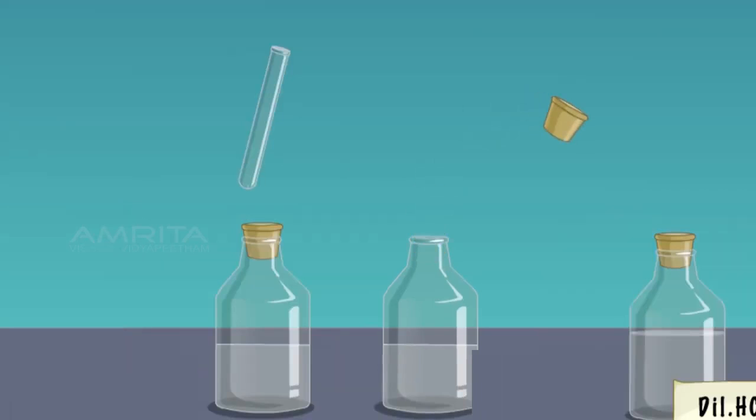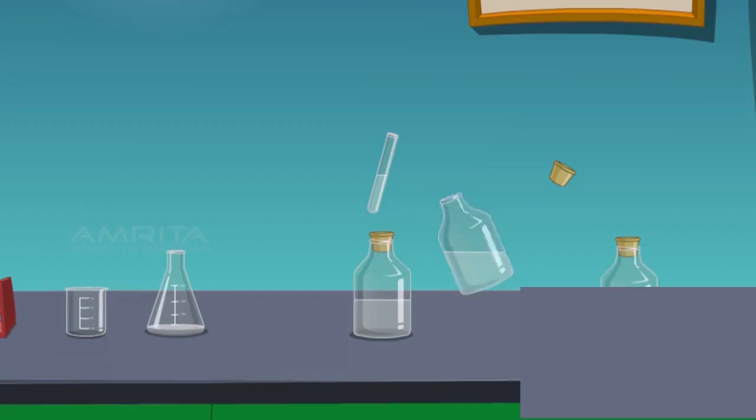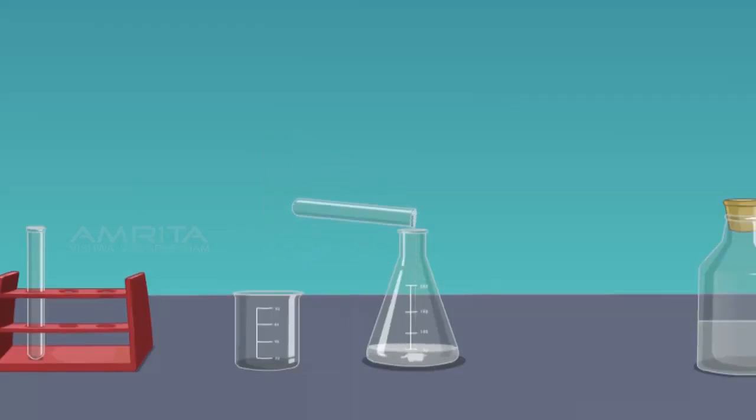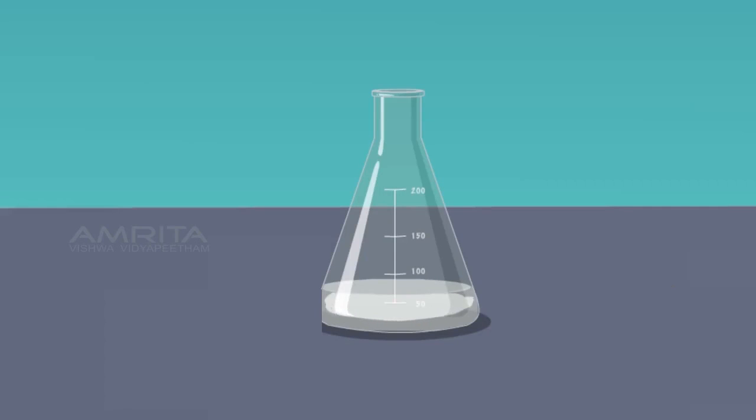So we'll take the acid out of the bottle, put it in the test tube. We'll head on over to our flask. We'll mix them together, pour them together, and you can see that there is a white precipitate forming. So write that down, white precipitate.